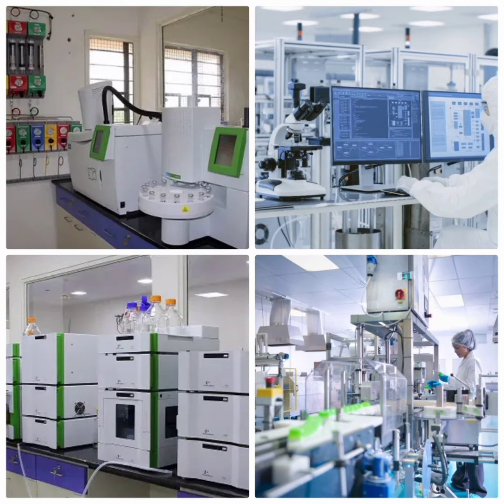Both HPLC and GC are versatile and have contributed to the ever-increasing scope of applications. Tandem techniques such as LC-MS-MS and GC-MS-MS have expanded the limits of detection to new frontiers of detection, and automation has also contributed to increased laboratory throughput.